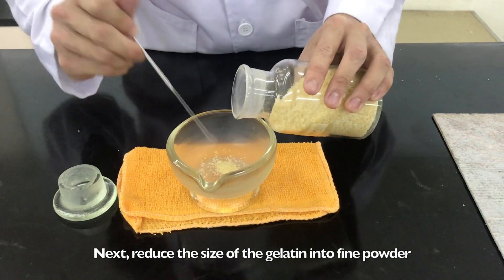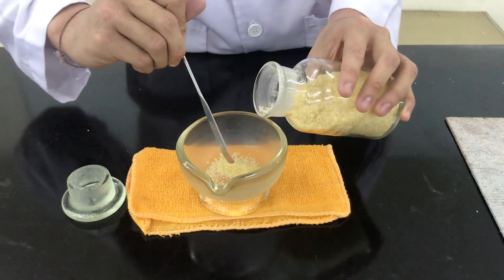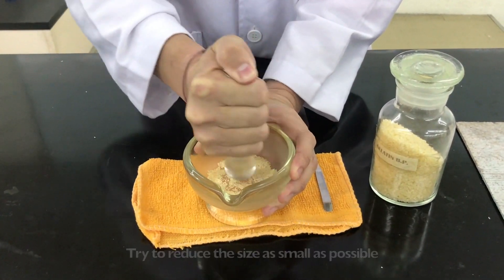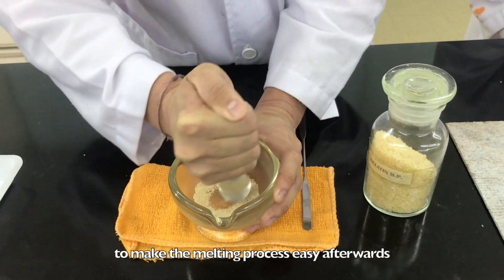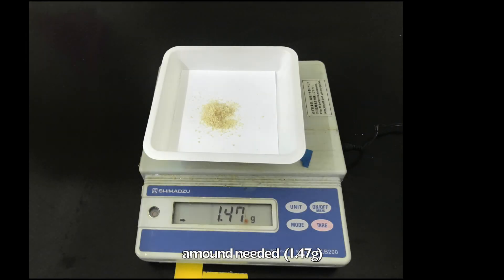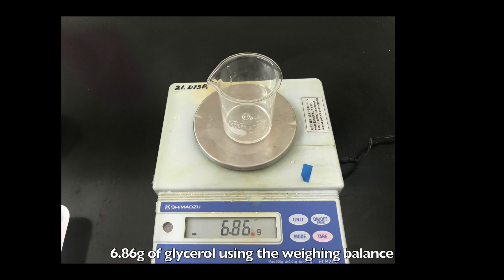Next, reduce the size of gelatin into fine powder by using a mortar and pestle. You may need to put in some force as the gelatin is quite hard. Try to reduce the size to as small as possible to make the melting process easy afterwards. Then, weigh the gelatin powder according to the amount needed, which is 1.47 grams. Weigh 0.2 grams of lactic acid and 6.86 grams of glycerol by using a weighing balance.